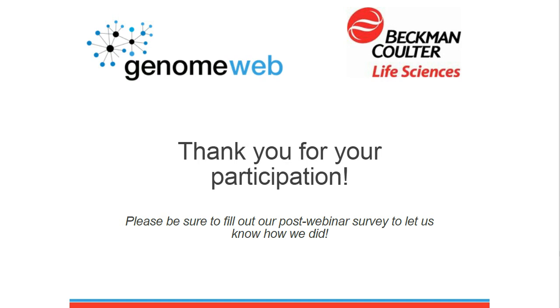Great, thank you. Vincent, is it possible to dispense living cells using the Echo? Yes, but typically the Echo is used to dispense liquid solutions. It turns out that you can also dispense living cells. We have done this a little bit. I know that some other groups have done this also a little bit. And the living cells stay living cells even after dispensing. There is no problem about this. That does not kill the cells. And you can dispense the cells like you dispense a liquid solution. So there is no problem at that level.